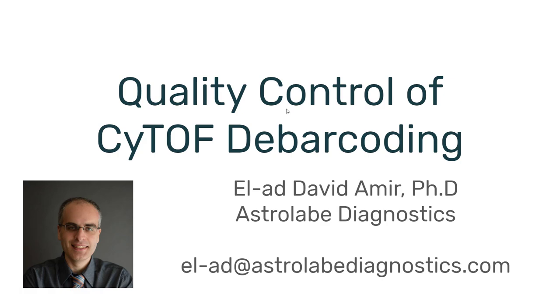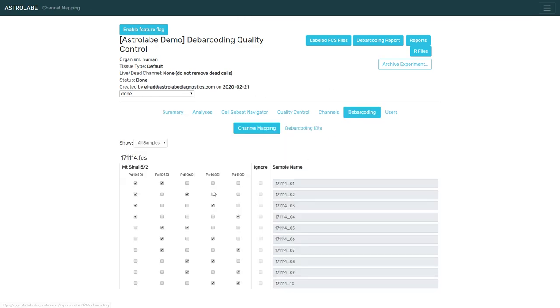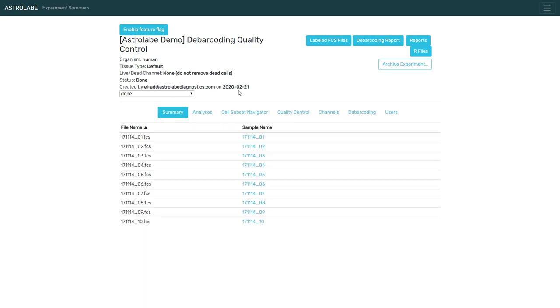Looking at Astrolabe, there's a few ways in which the platform helps you do the quality control on your barcoding. First, when you set up the experiment, you can set up the barcoding scheme. We support the Fluidigm barcoding kit, Livecell barcoding, cisplatin barcoding, really anything that comes to mind.